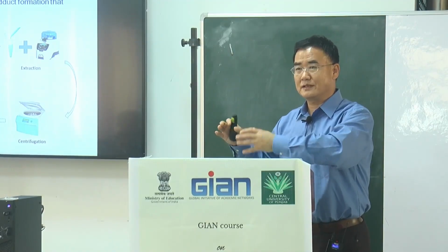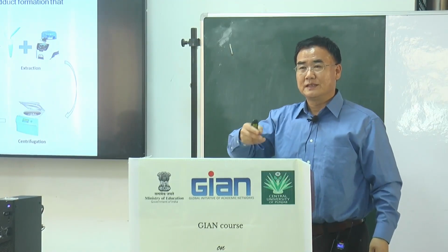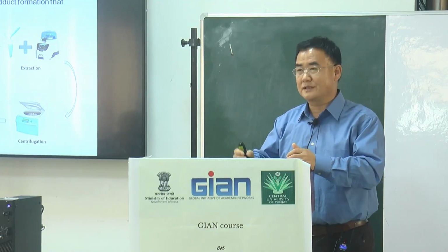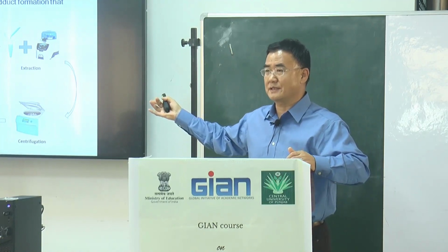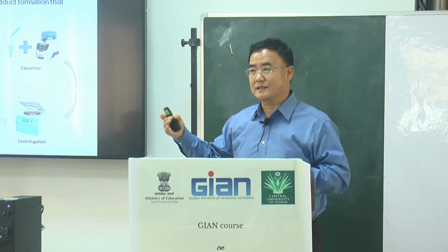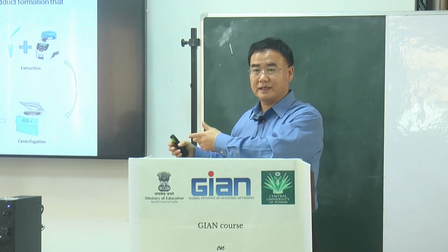There is always crossover, so that you can handle real situations. Sometimes we cannot limit one machine to one field. GCMS can also be applied to some soluble compounds, as long as they can be evaporated into gas, they can easily be analyzed.